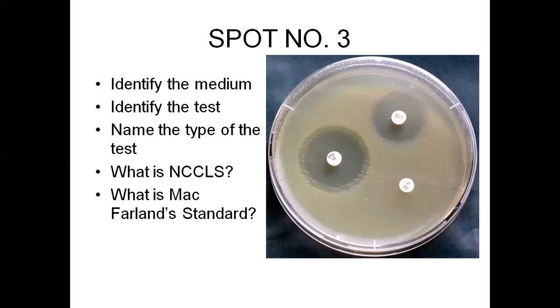What is McFarland standard? This is that when we are putting the antibiotic sensitivity test, we can put bacteria and spread it on this agar. This is called carpet technique. Carpet technique, it is that we are going to take a colony from another agar.